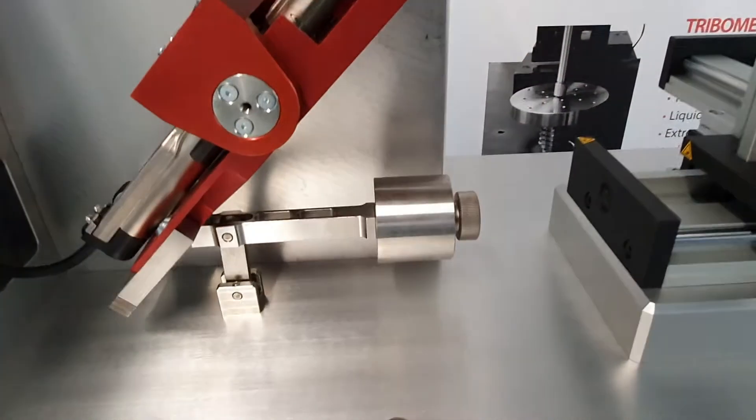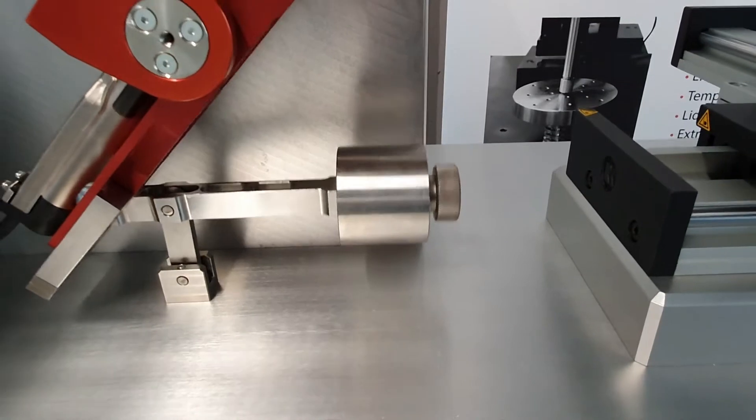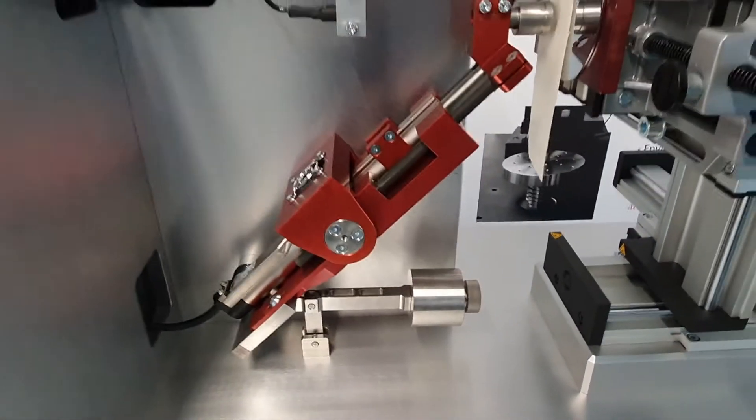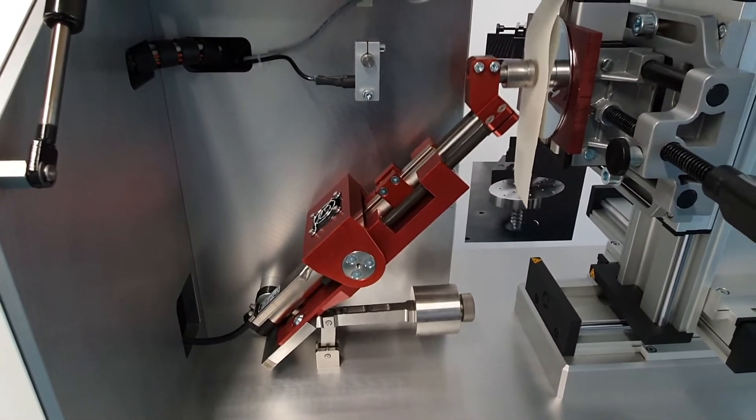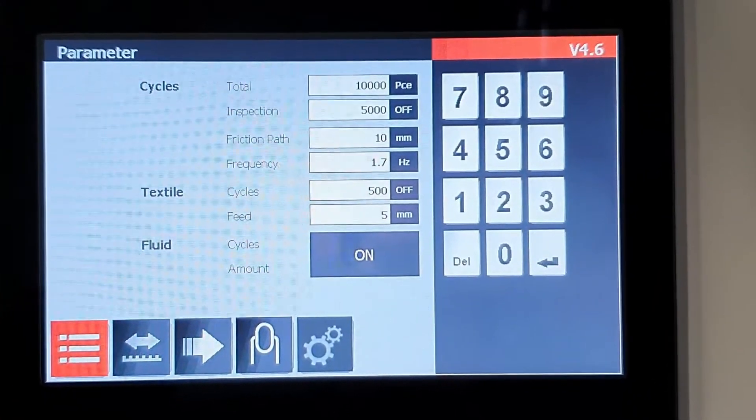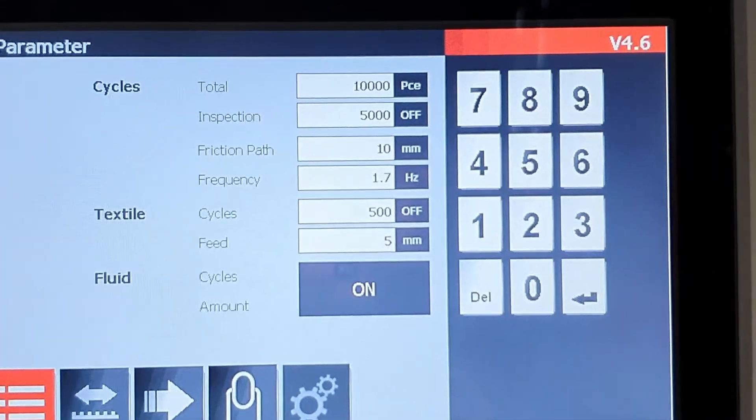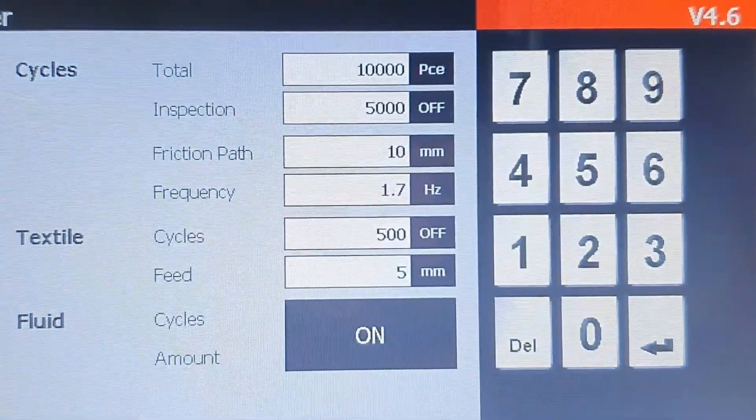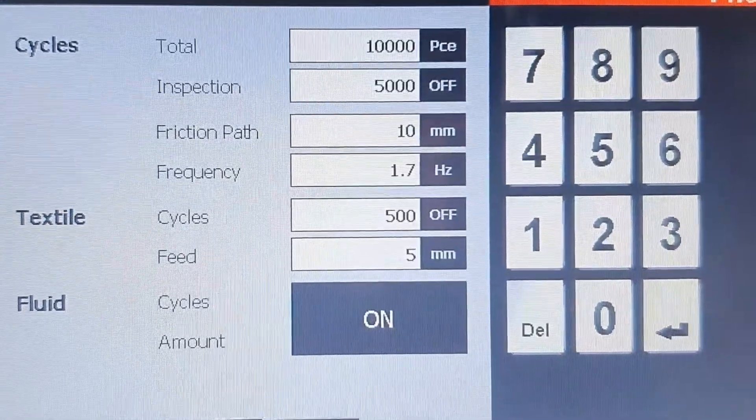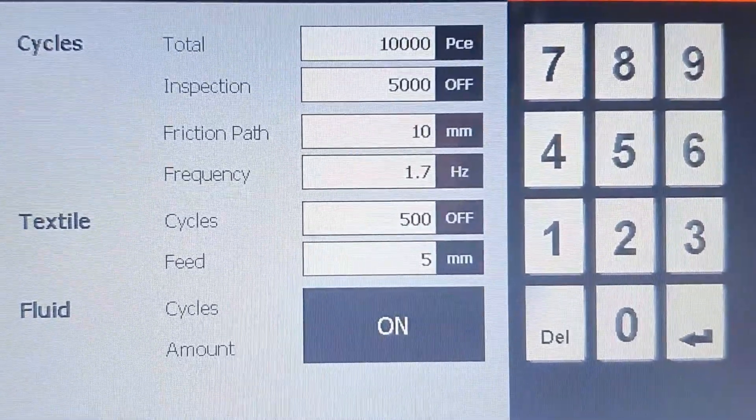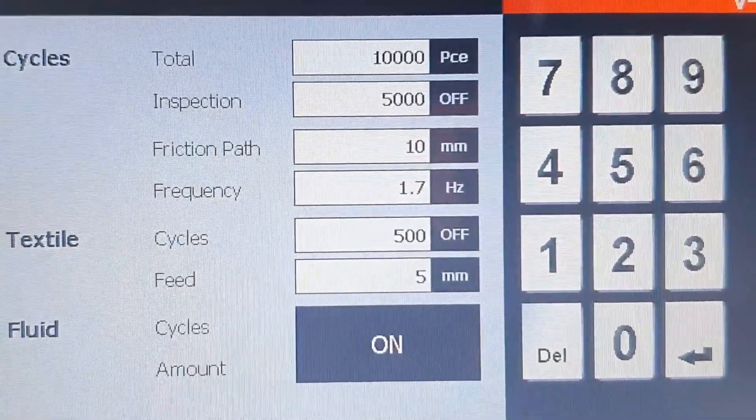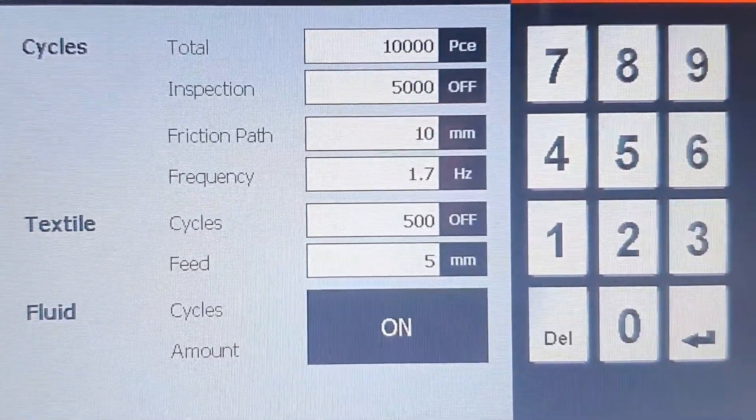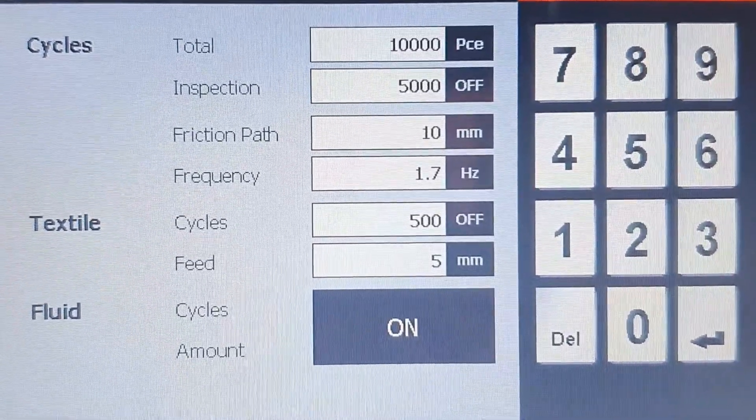The severity level of the test is given by the test load. In our case we are using a 10N test load. We do a total of 10,000 test cycles. After 5,000 cycles we perform an inspection stop. The friction path is defined by 10 mm. We will move the textile 5 mm every 500 cycles. We do the test under dry condition, no fluid.